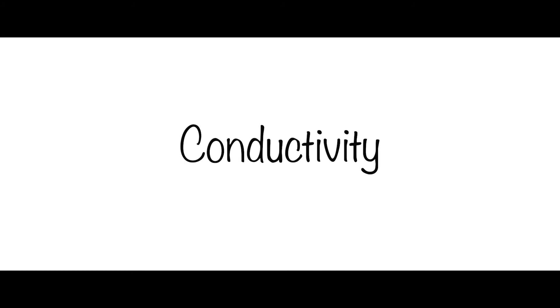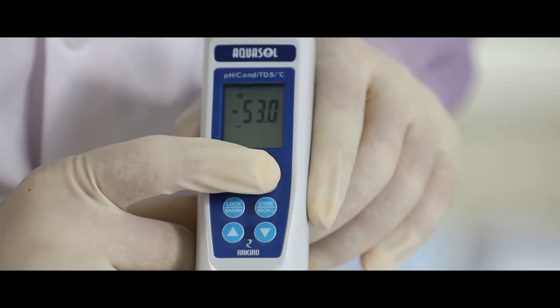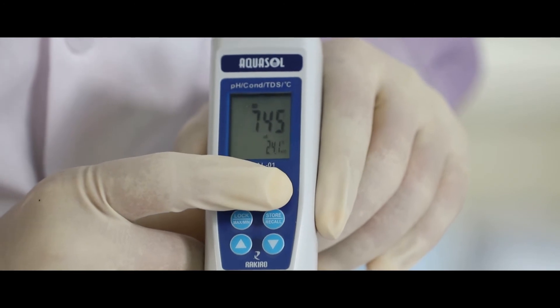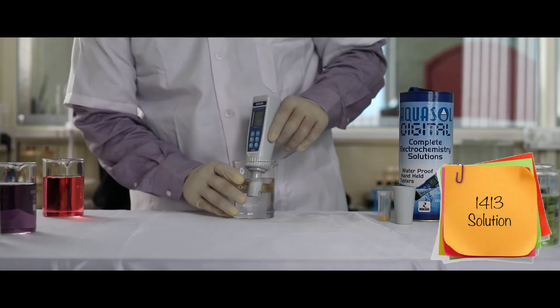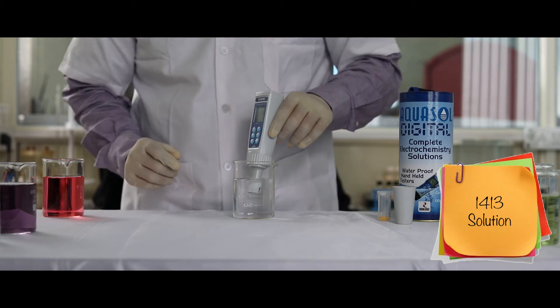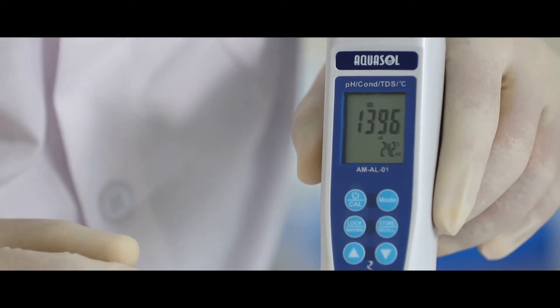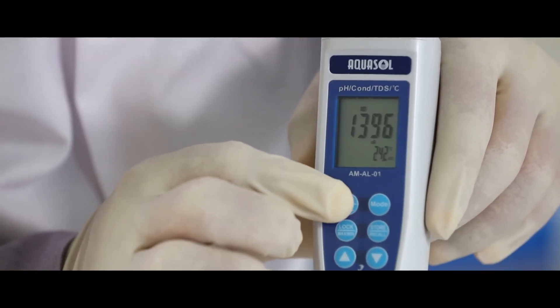Now for conductivity calibration. Press mode key to change from pH to conductivity. Dip the electrode in the standard 1413 solution. Stir gently for a stable reading and then press CAL key.